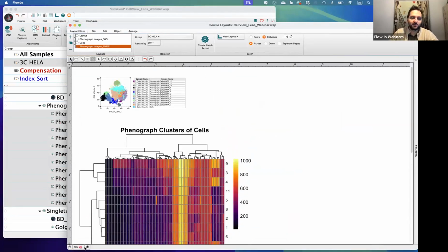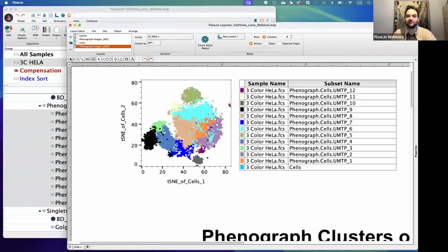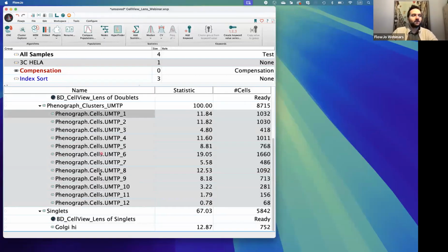That's very nice because you see how nicely they still separate the populations into different clusters based on the imaging derived parameters. That's what we wanted. And imagine if you also add the flow parameters on top, you will have even better separation. Let's keep that in mind and move to the image sets. Now, image sets.